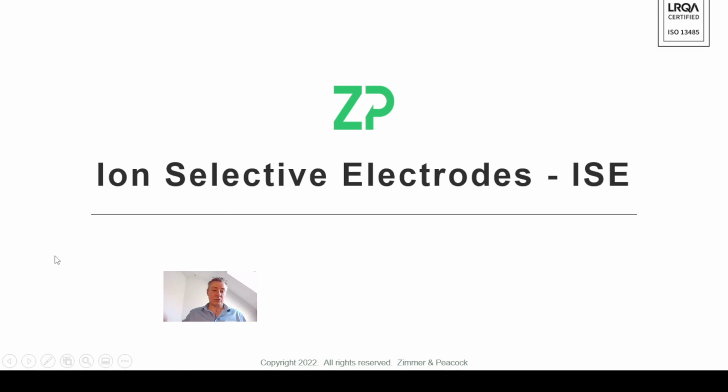So I'm going to dive now into ion-selective electrodes. We just spent some time talking about voltammetry. Now I'm going to talk about ion-selective electrodes.